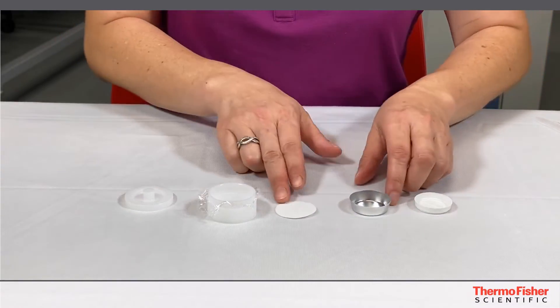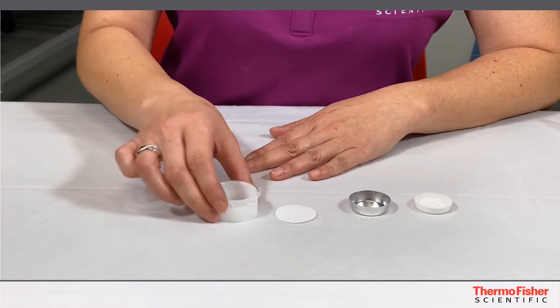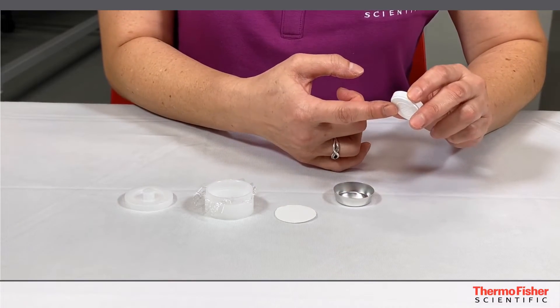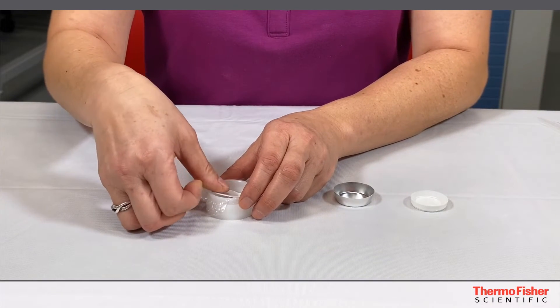There are multiple things you can try out there. We have a filter paper here that we cut to kind of the same size, or you can use an aluminum cup or a plastic backing to place inside over the loose powder.